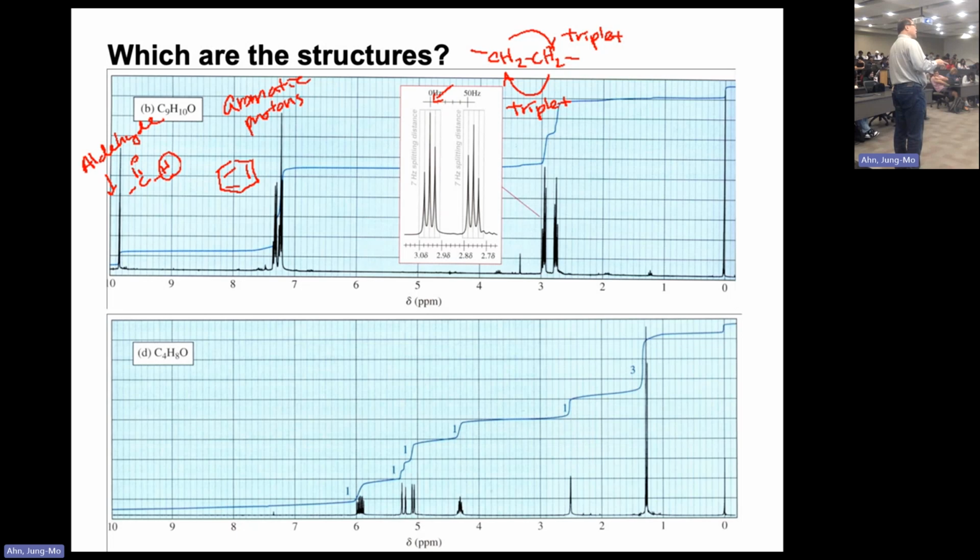And then we talked about the half steps of 1 proton. So these are 2 hydrogens here and 2 there. So CH2, CH2. That's basically what it can code. Being next to each other, it could be triplet, triplet. So with the integrations, position of the signal, and splitting pattern, we can figure out that this belongs to the benzene with the 5 hydrogens.